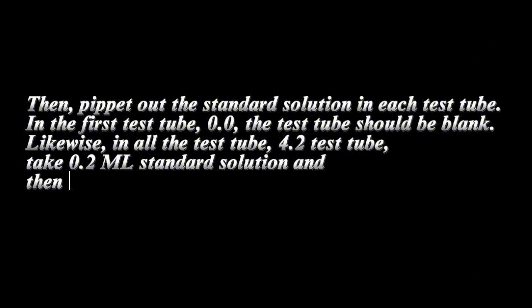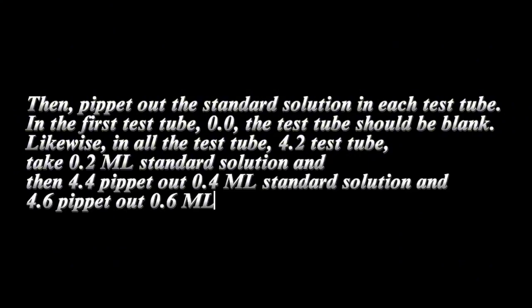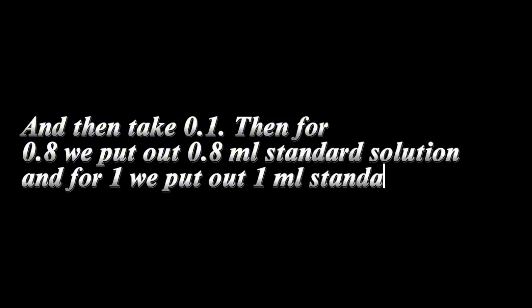The first test tube is the blank with 0.0 ml standard solution. For 0.2, pipette 0.2 ml; for 0.4, pipette 0.4 ml; for 0.6, pipette 0.6 ml; for 0.8, pipette 0.8 ml; and for tube 1, pipette 1.0 ml of standard solution.